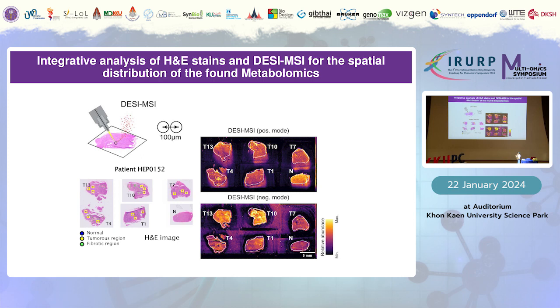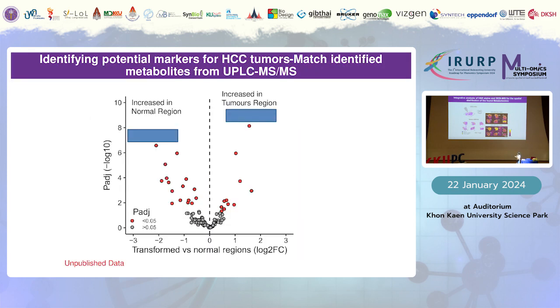By integration of the histology study together with the mass spec, you can really pick out the tumor region precisely, tumor region spectra and the non-tumor region. So this way, it's easy to interpret it.